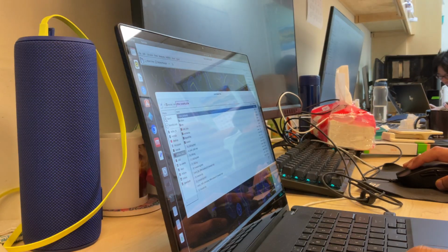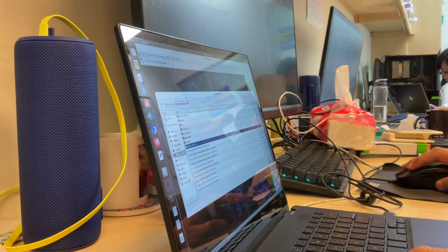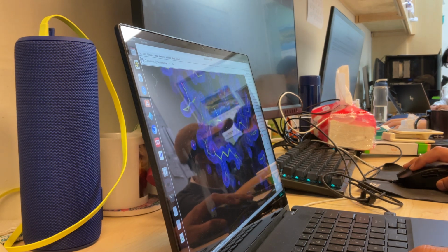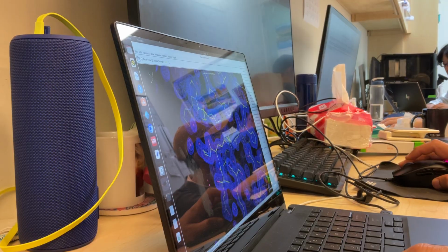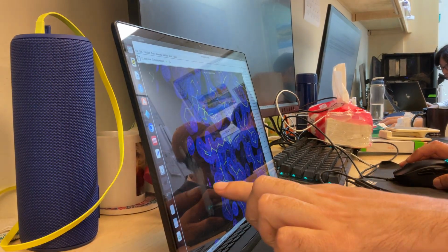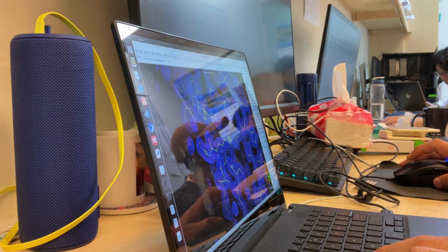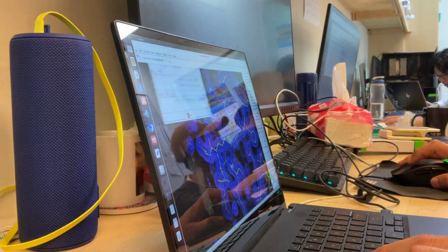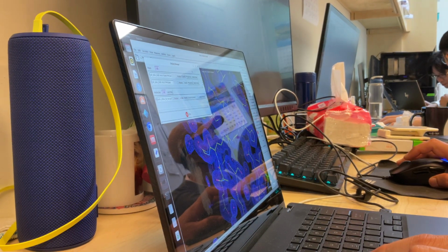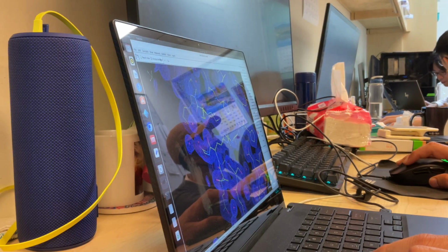Now we can open this one, and we can generate it like this with the experimental structure factors. And see, these are the experimental structure factors. For example, here, these guys appear at a higher sigma level, 0.7, experimental. While in this one, they appear at 0.42. So that's what I meant.